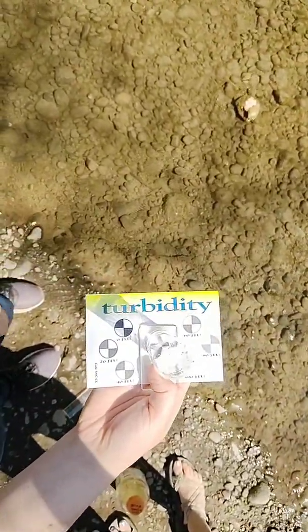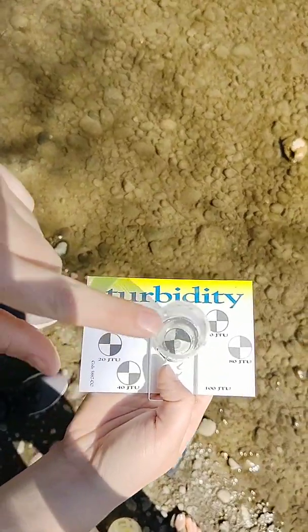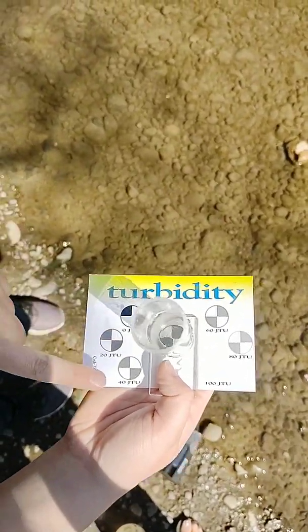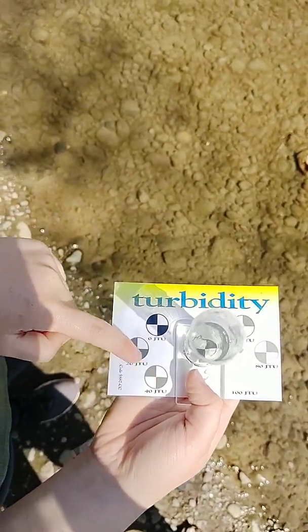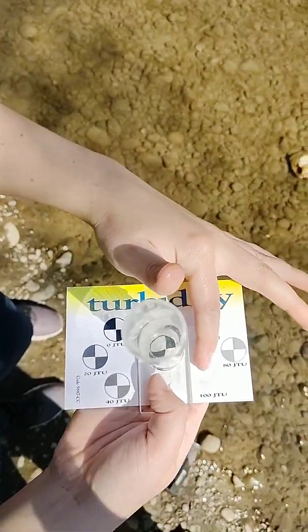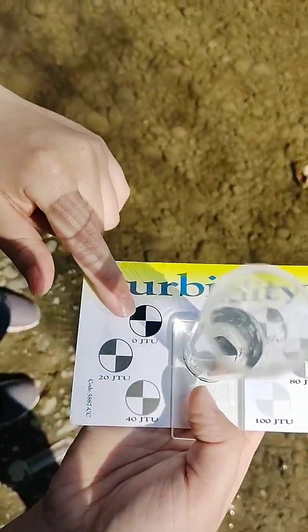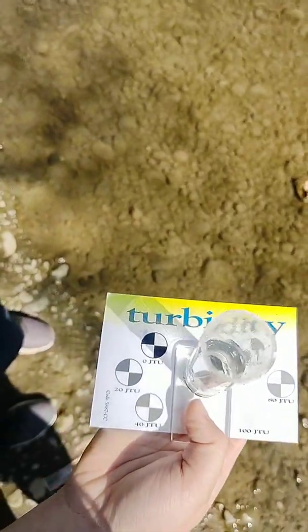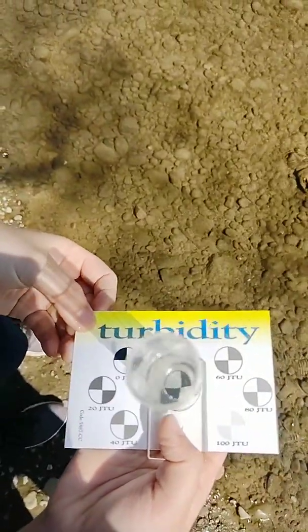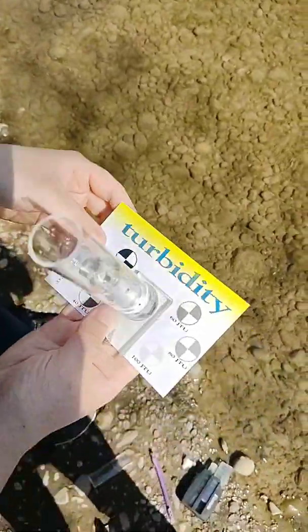So yeah, you're going to look into the tube and you're basically going to compare and see how faded this middle Secchi disc looks and see which one of these on the side best represents that. So if it's really faded, it might be 100 JTU, like you barely see it at all. If it's not faded at all, it might be 0, like there's no sediment in the water. So it might be hard to see on camera, but determine what you think is the turbidity measure. I'm going to take a look now and see what I think.